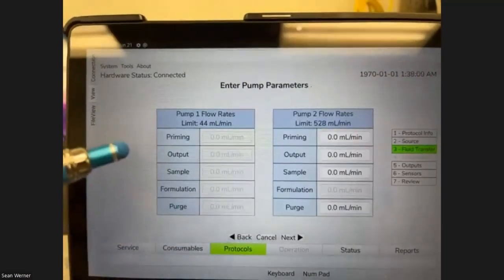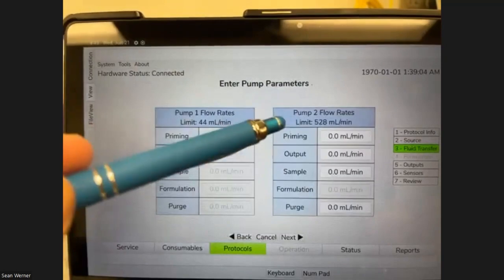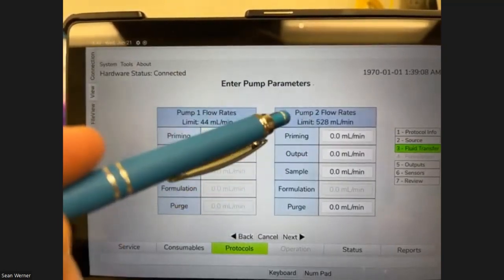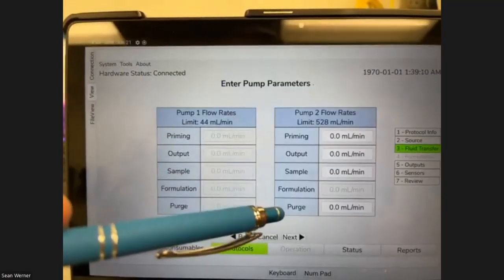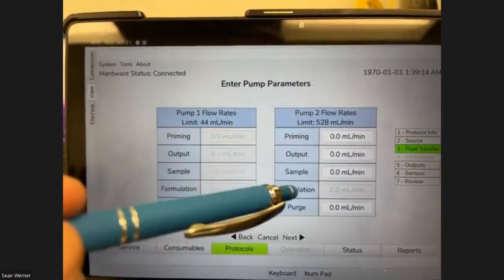Oh, okay. All right. So anyway, one of the key elements of the fluid pathways is that because of the way it primes and purges the line, you end up with very little holdup volume in the fill set, in the transfer sets.